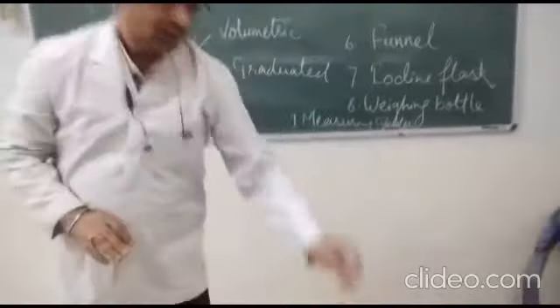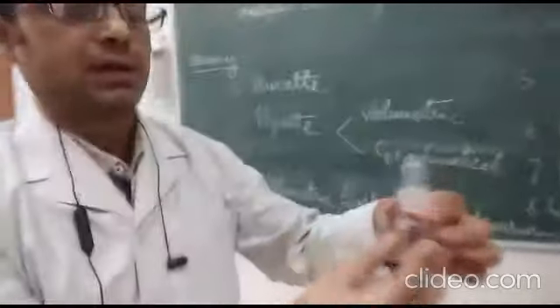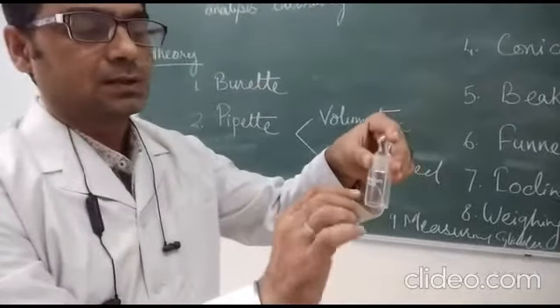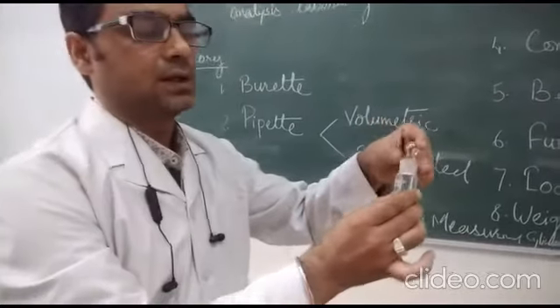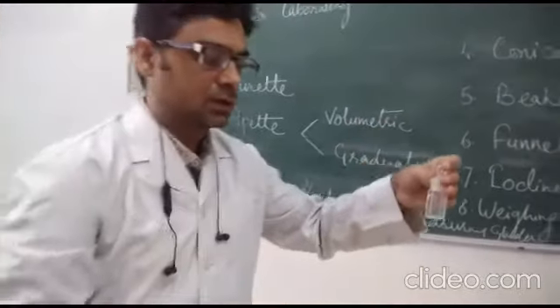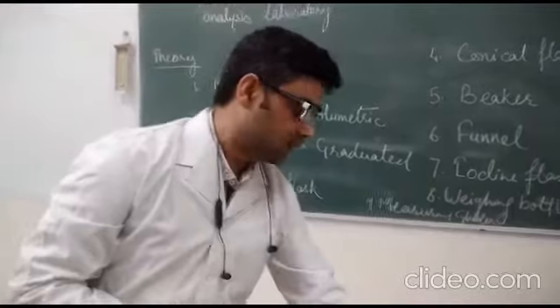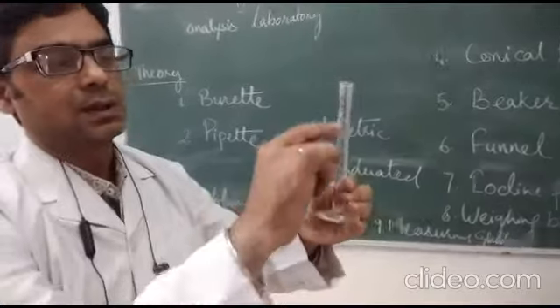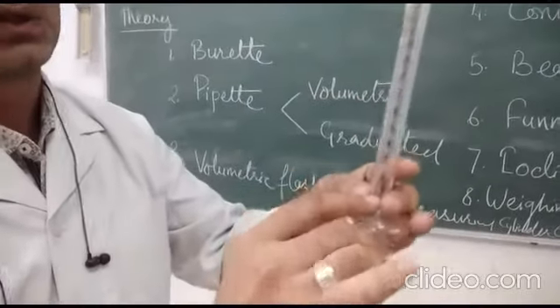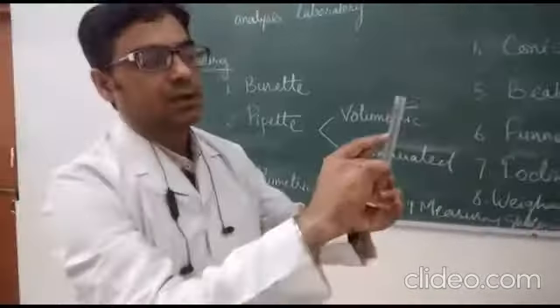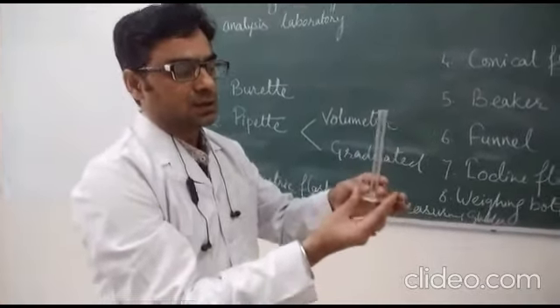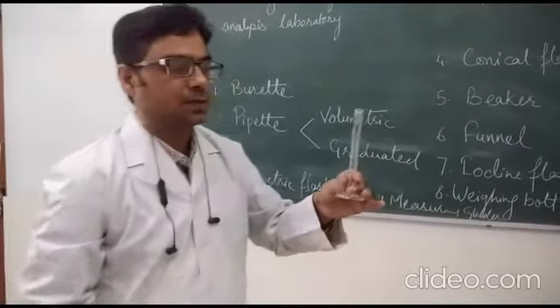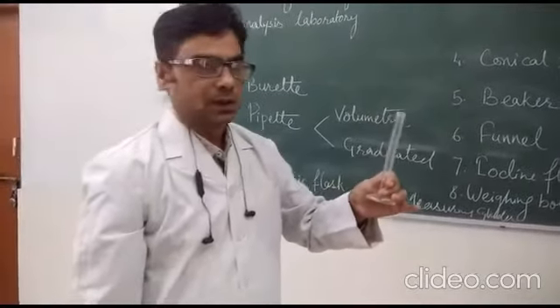Next is the weighing bottle. This is the weighing bottle — it has a lid and a base. We place the compound inside and it is used for weighing the compound. Then we have the measuring cylinder. This is a 10 ml measuring cylinder with graduated marks, used to transfer whatever volume we desire. It is also available in 50 ml and 100 ml sizes.